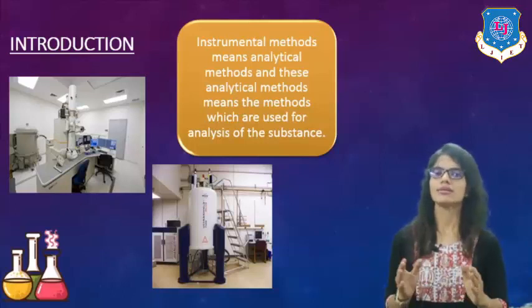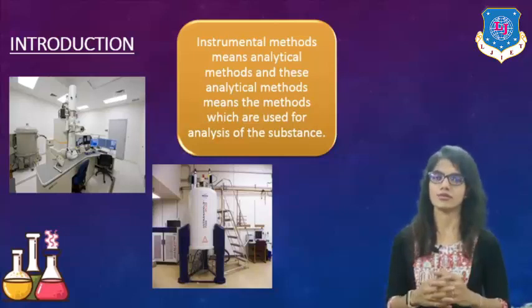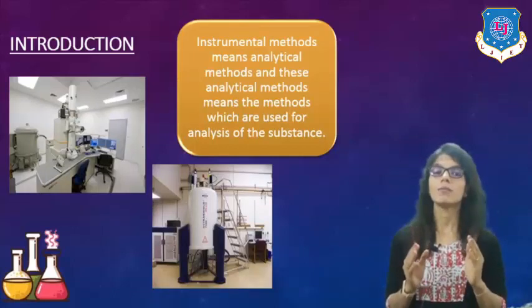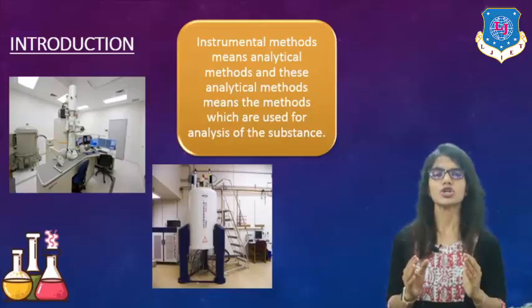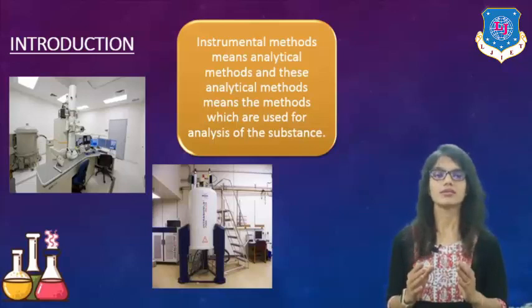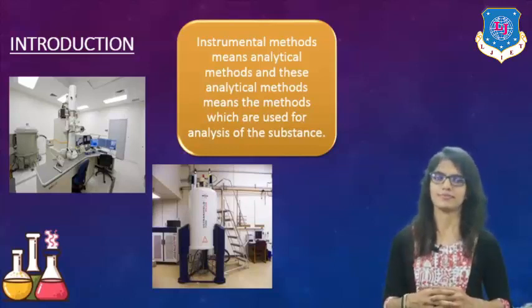All these techniques are known as very sophisticated hyphenated methods, and they will give us results for a pure substance, or even a combined substance or a mixture of compounds, very precisely. That means the results are considered final when we deal with such instrumentation methods, right?